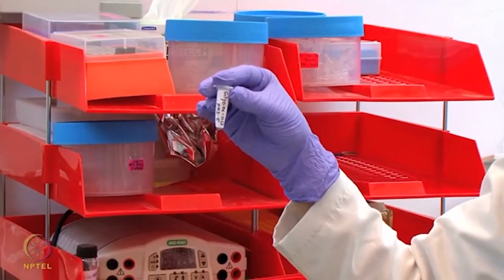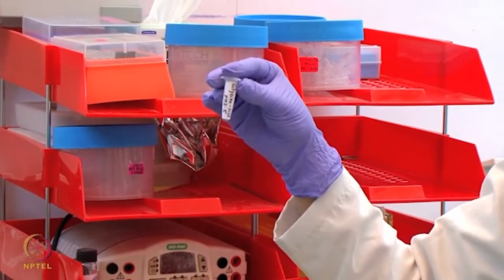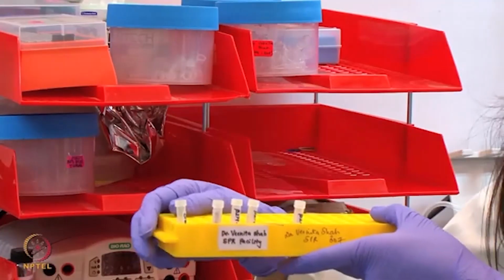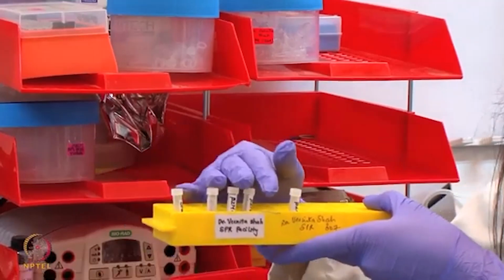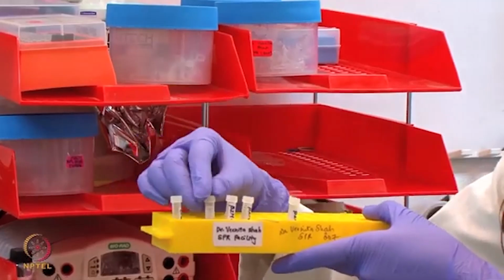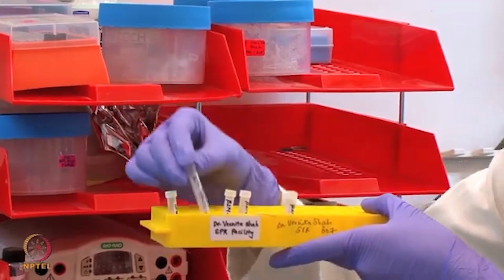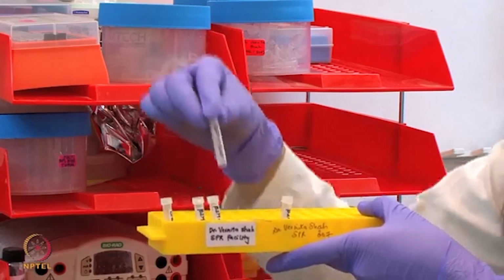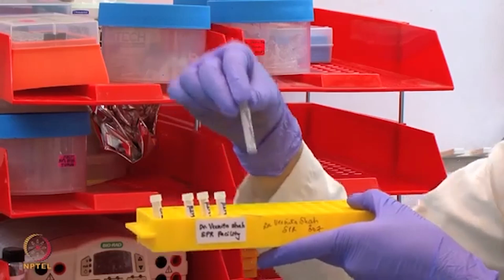For the regeneration of the surface, we have prepared glycine HCl pH 2.5 as the regeneration solution. We have transferred all the solutions in the specialized tubes starting from the startup, beta-2M concentrations starting from 85 nanomolar, 42.5 nanomolar, 8.5 nanomolar and 0 nanomolar.